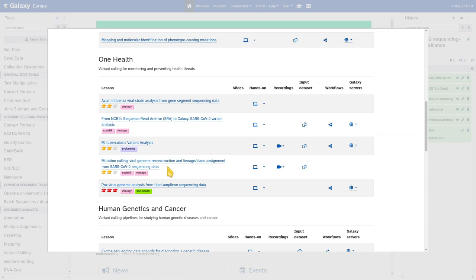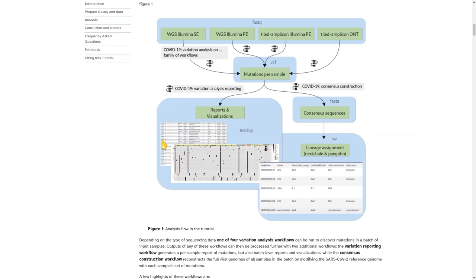To take a brief look at the outline: we're going to run a sequence of production-ready workflows that can be used to perform a full SARS-CoV-2 sequencing data analysis, complete from raw sequence reads up to quality control reports and consensus sequences of the viral genomes. The analysis works with complete batches of samples like they would come out of real-world genome surveillance projects. We're going to look at reports and visualizations both at the sample and batch level, and we're going to do lineage assignment using Nextclade and Pangolin.